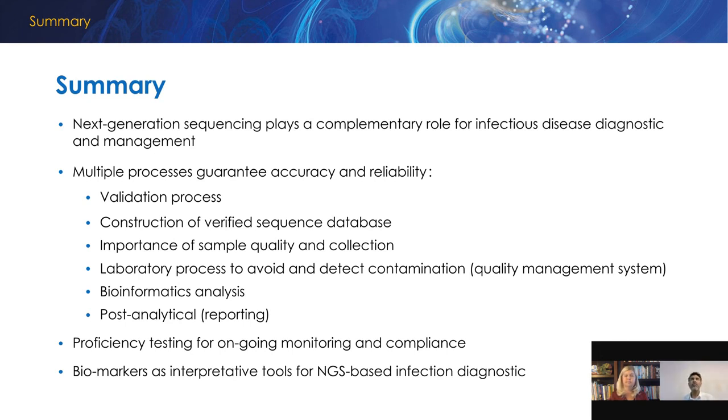It could be viable, but one of the strongest barriers, but also challenges, the laboratory has is implementation of a strong database or bioinformatic pipeline. I think that's one of the biggest limitations. We have an amazing platform currently in the market able to provide sequencing. There is protocol described, and even the company who provide the platform, the sequencers, are able to provide papers about different protocols for extraction and sequencing. But one of the biggest limitations is to have a curated and strong database.